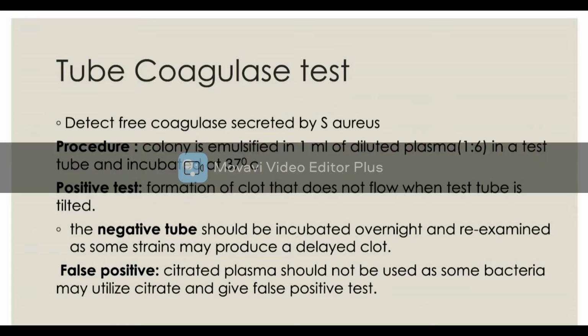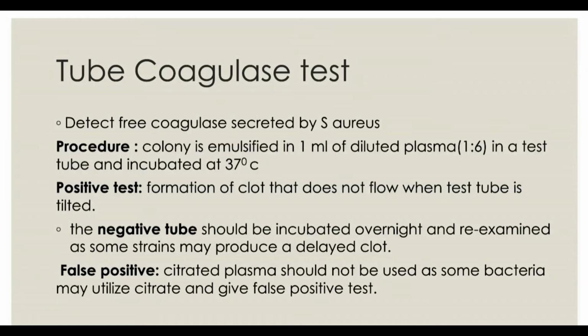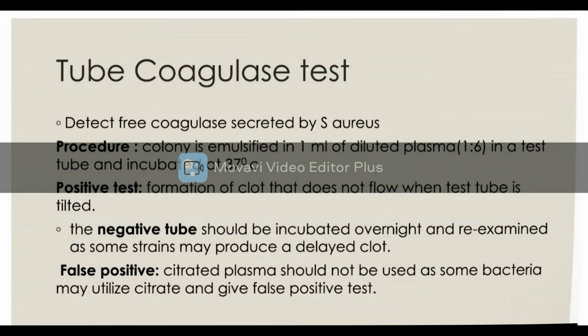And false positive: sometimes it produces a false positive, where the organism is not Staphylococcus aureus but shows positive clotting. This is due to citrated plasma. Citrated plasma should not be used because some bacteria may utilize citrate and give a false positive test.